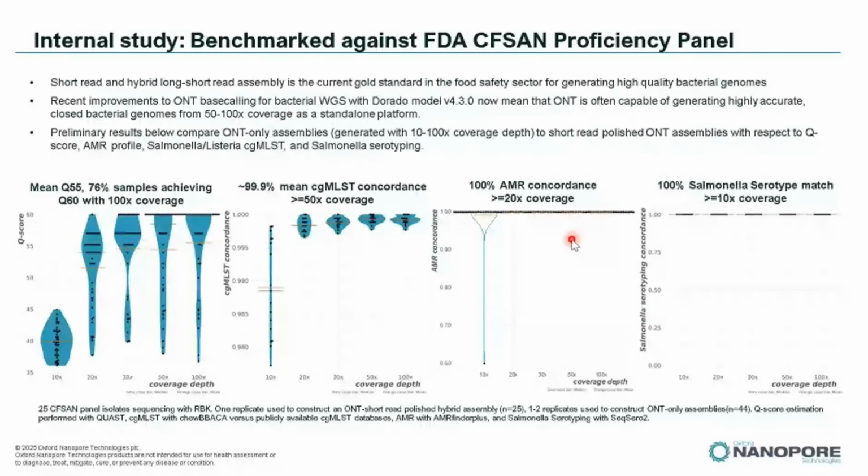Just now was some commonly used strains, but internally at Nanopore, we also performed sequencing using Oxford Nanopore and compared to the FDA panel bacterial strains. Again, we are trying to see whether the data produced by Oxford Nanopore is comparable to what we expected from those reference strains.